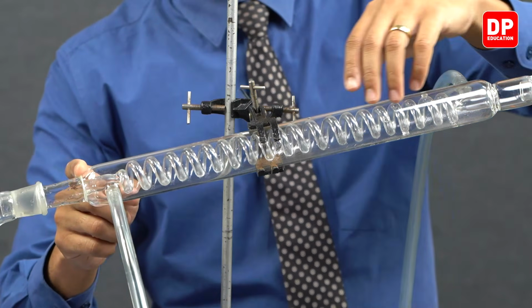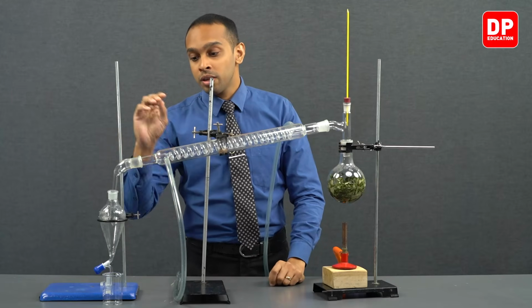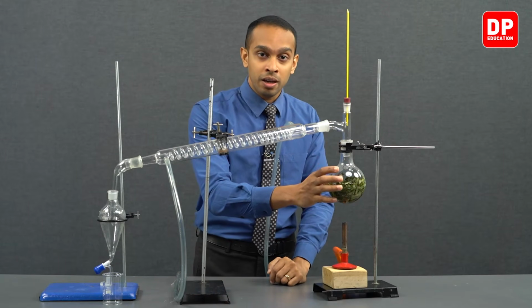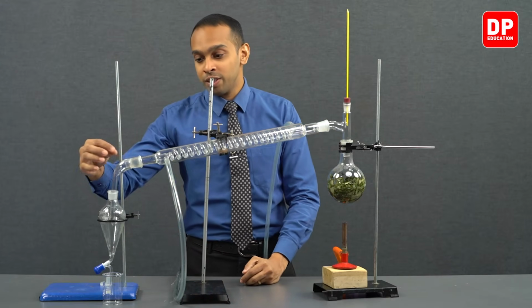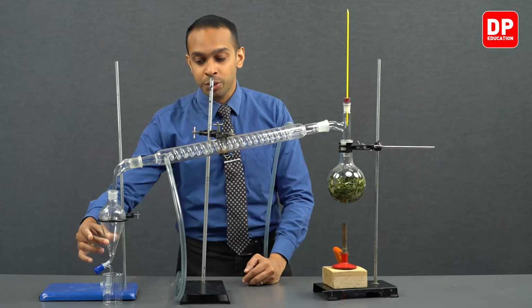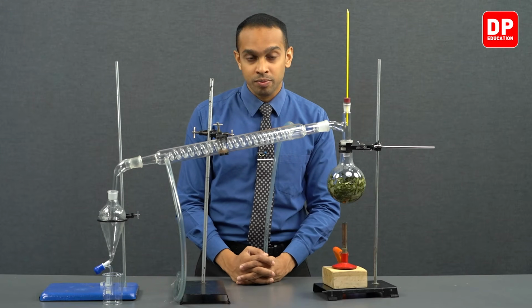As the vapor travels, it will cool down and will turn into a liquid. This liquid will be a mixture of two liquids, water and the essential oil extracted from the cinnamon leaves that we have over here, and this mixture will be directly poured into our separatory funnel that we have over here. So students, then later on we can use the separatory funnel to separate the two immiscible liquids.